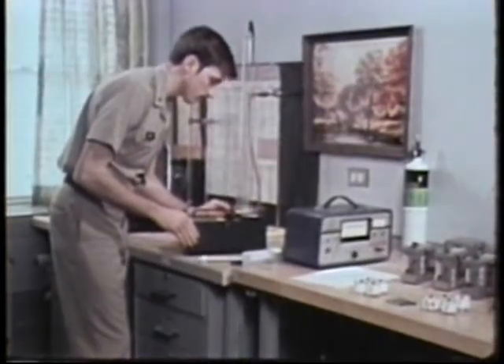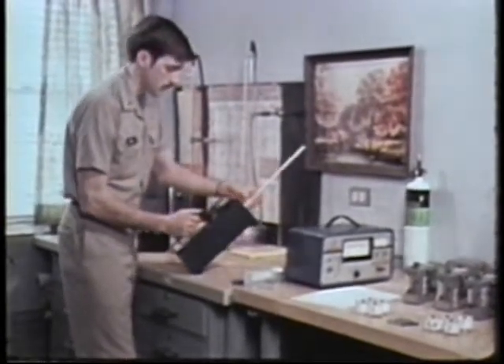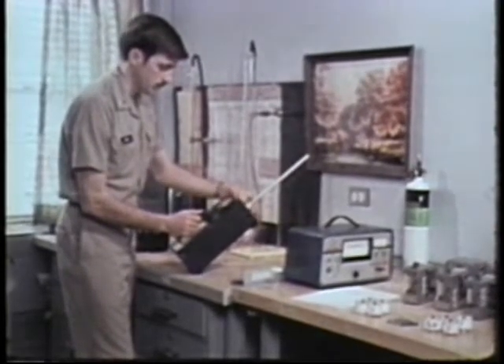The instrument requires a long warm-up period, 10 to 20 minutes. When it's warmed up and with the probe connected, you can zero the meter.